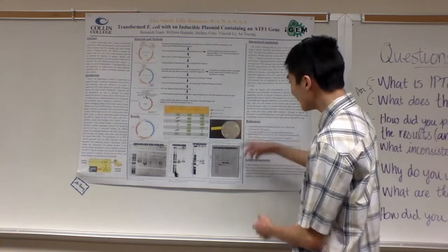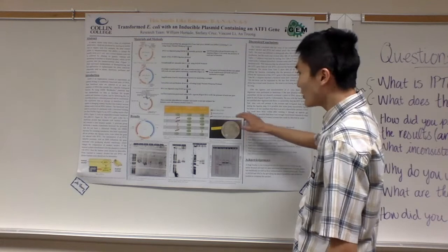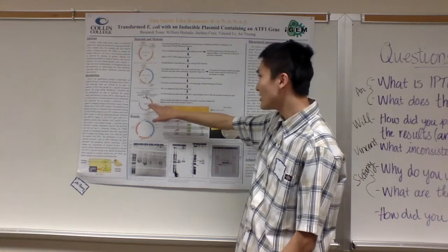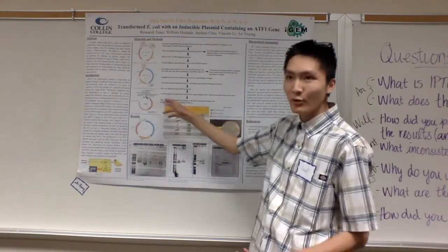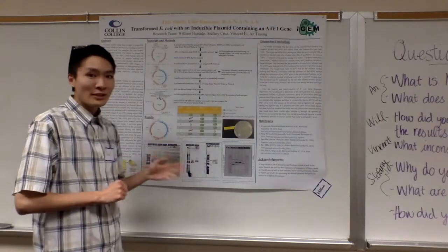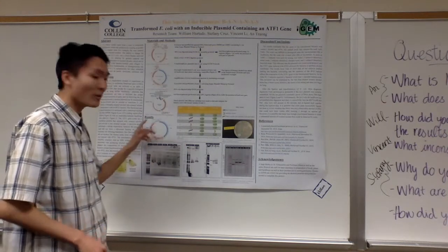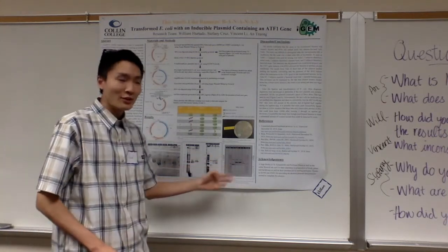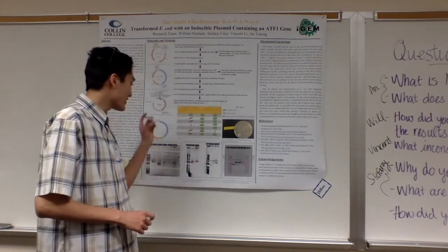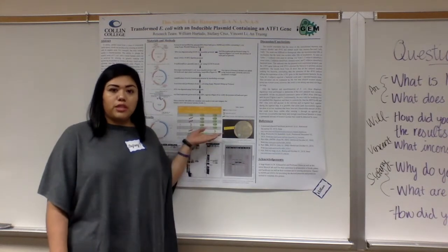Because this bacteria with the plasmid is actually AMP resistant, we could infer that it's somehow taken up a 2,000 base pair ampicillin backbone that religated back together without taking any of the parts. Our results conclude that there are actually some bacteria that have taken up a fully constructed form of our plasmid. Due to the results of the gel, there doesn't seem to be a detectable amount of plasmid that was successfully taken in. However, we could see that we had enough bacteria to produce the banana scent.